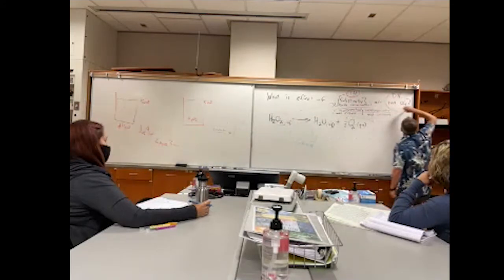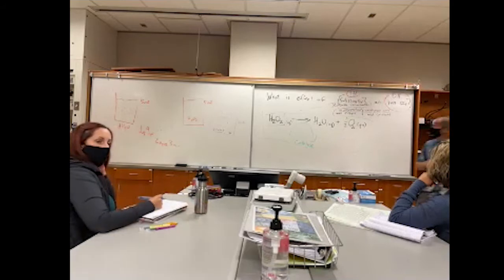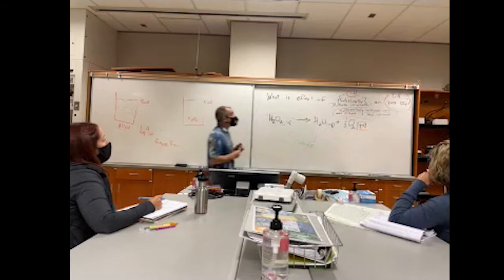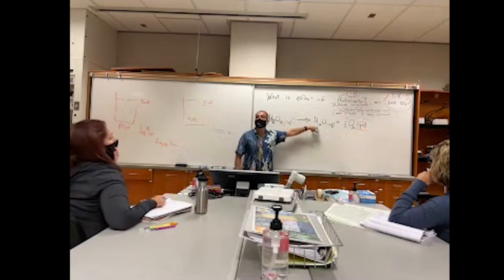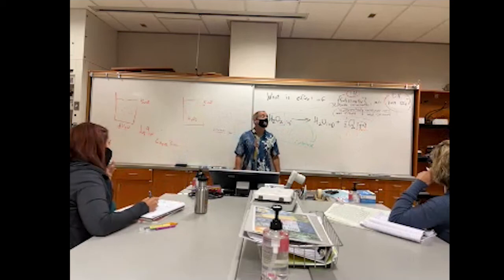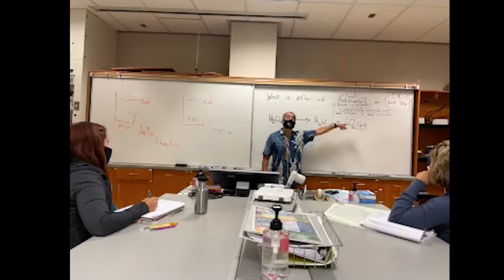This part is where it's going to get more complicated. How are we going to find some way to actually quantify and measure the reaction rate? One of the nice things is that oxygen is a gas. When H2O2, hydrogen peroxide, becomes H2O, we don't see anything happening. Water and hydrogen peroxide look the same. But oxygen gas is these little bubbles that are coming out.